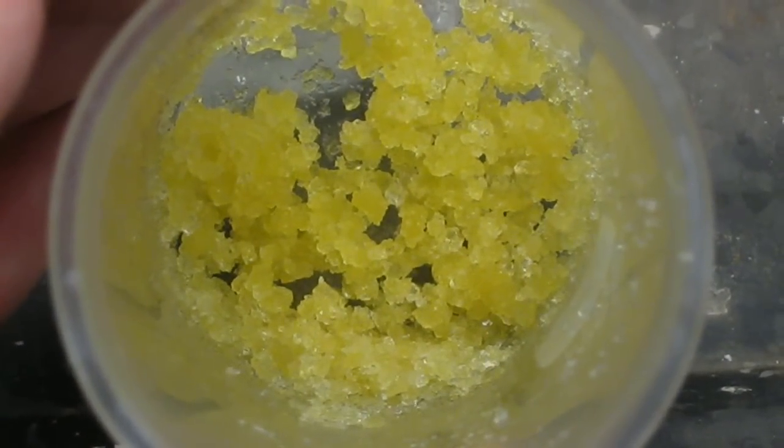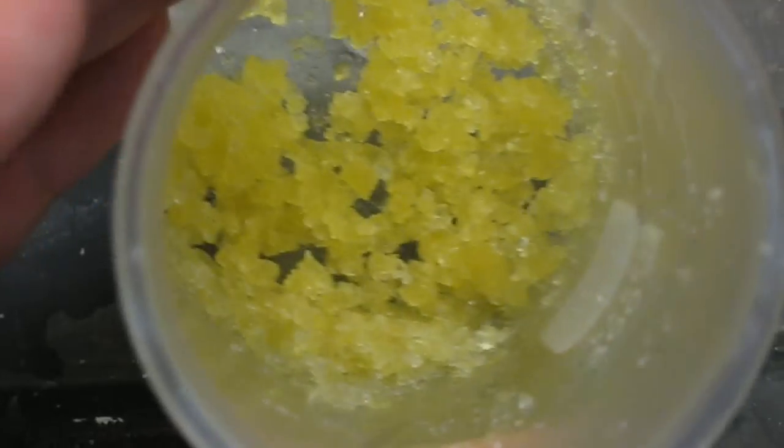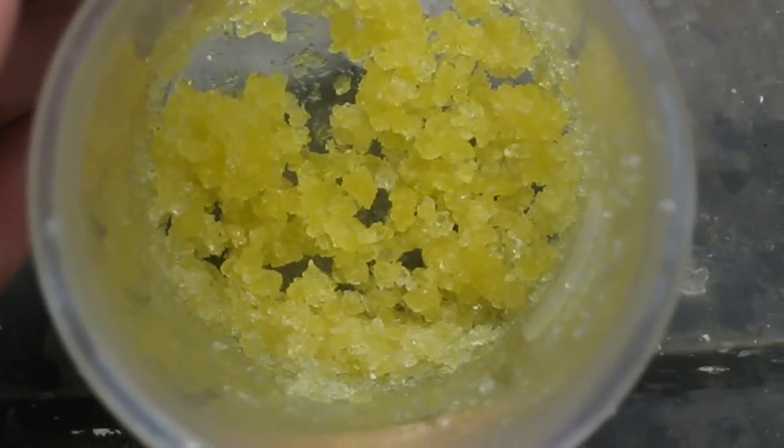When it's dry it should be a white solid. If it's a yellow solid it means there's still leftover chloride in the product, and you should add more nitric acid and water to completely react it.